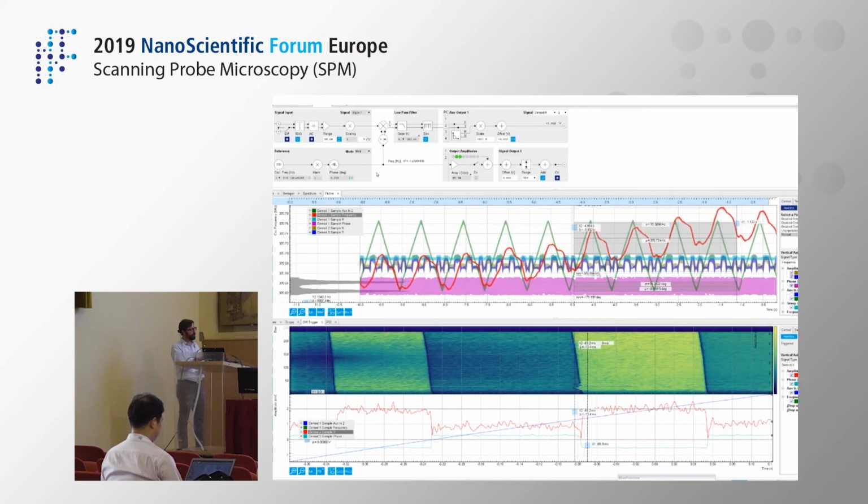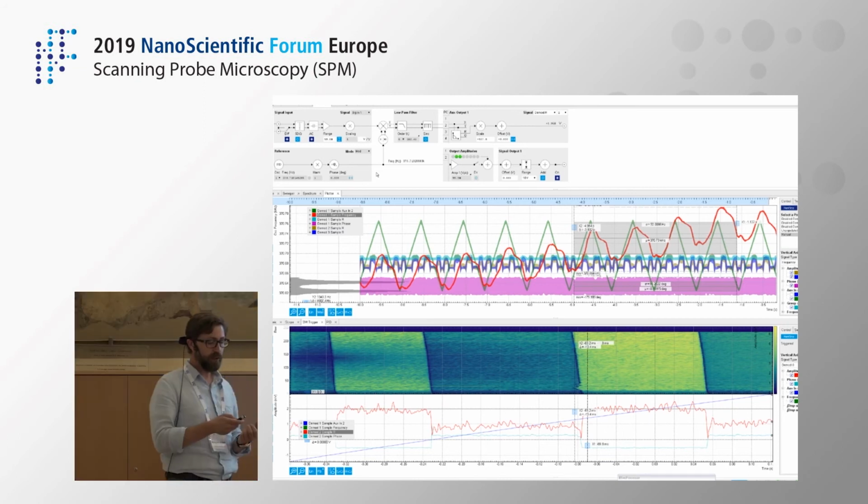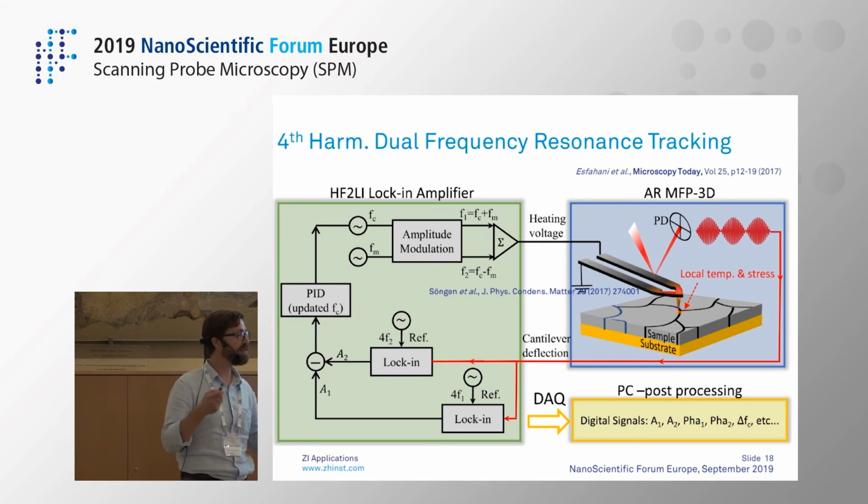You can also record the images digitally, not necessarily on the auxiliary output. That's just an example where you have a sawtooth corresponding to your forward and backward, and now you trigger, and then every line corresponds to the frequency shift or to the amplitude that you get. So this you can do for in-plane and out-of-plane at the same time, but another way of doing it is that PFM and contact mode resonance techniques are often quite complex, and sometimes you have contributions from ionics, from thermal expansion, and of course from piezo response, piezoelasticity, I don't know.